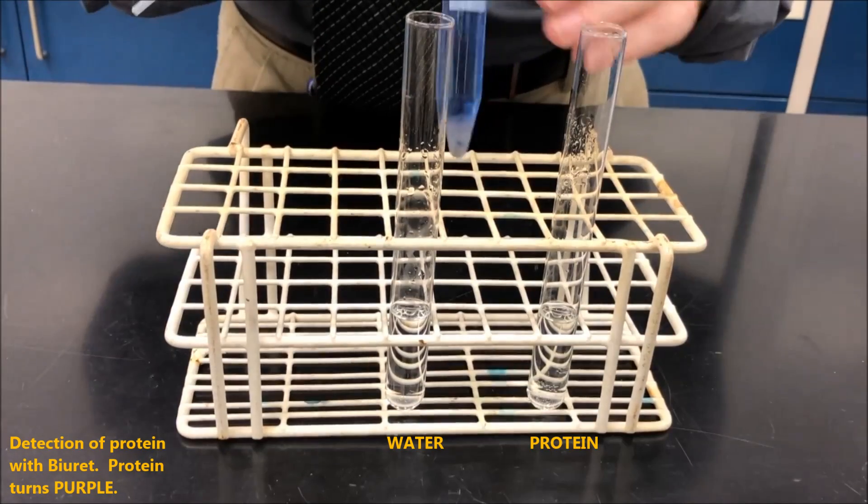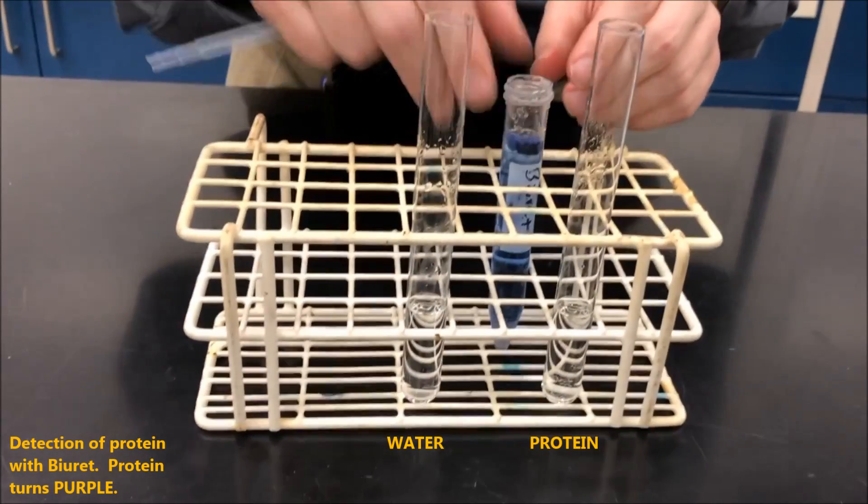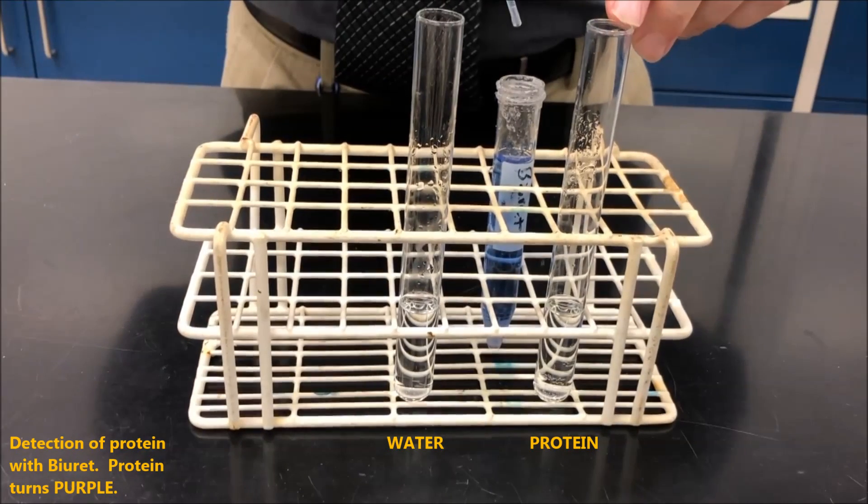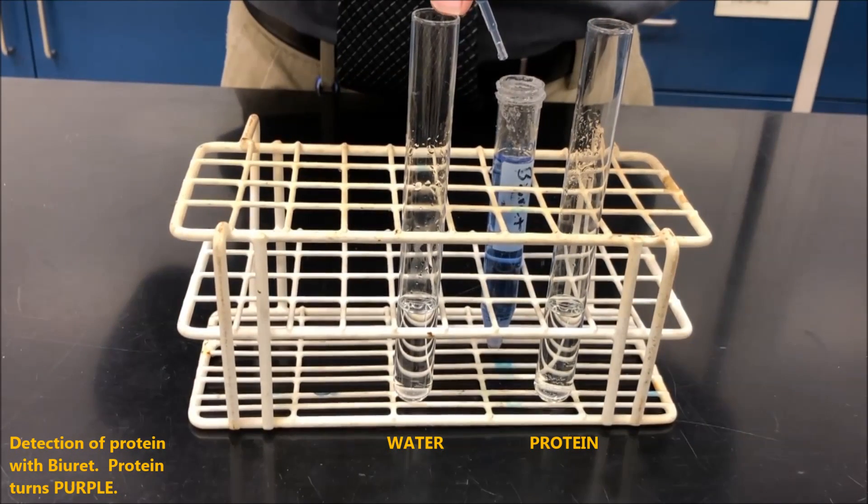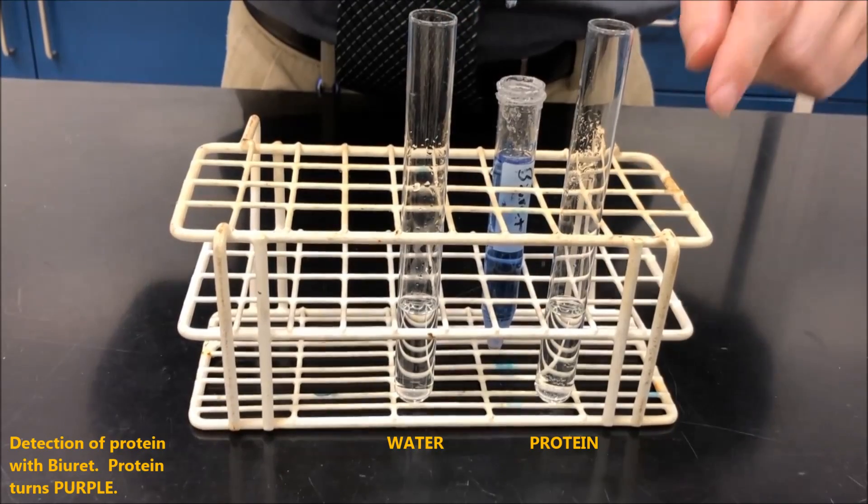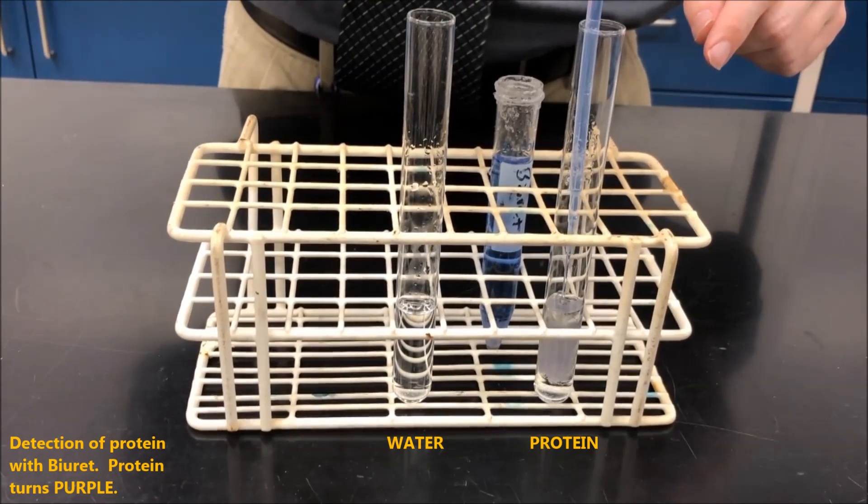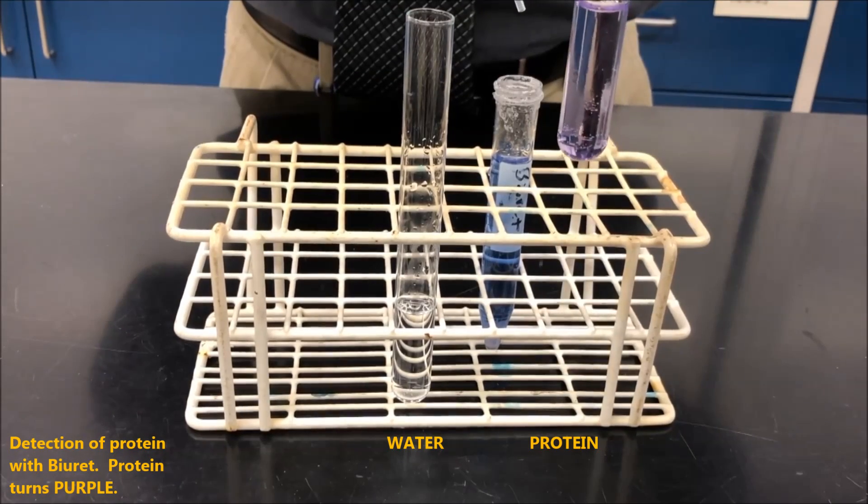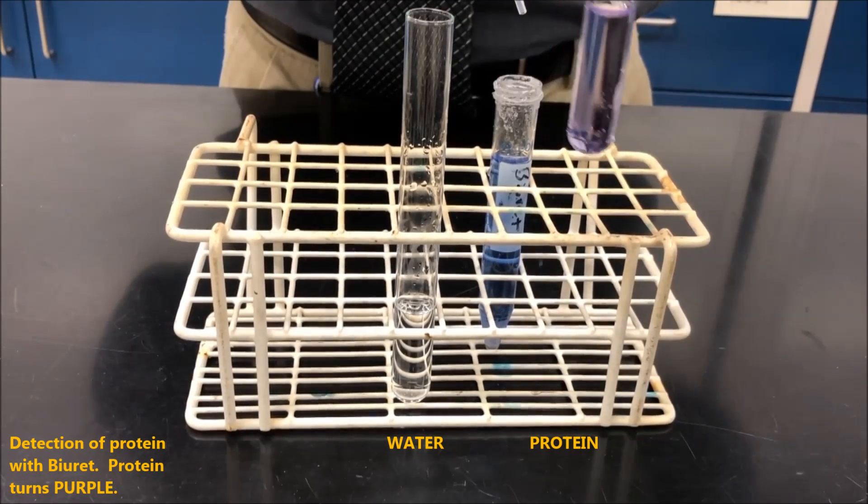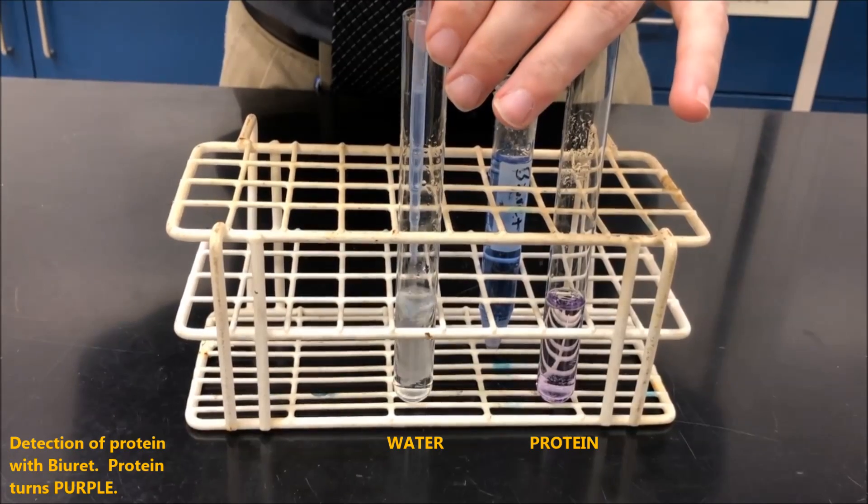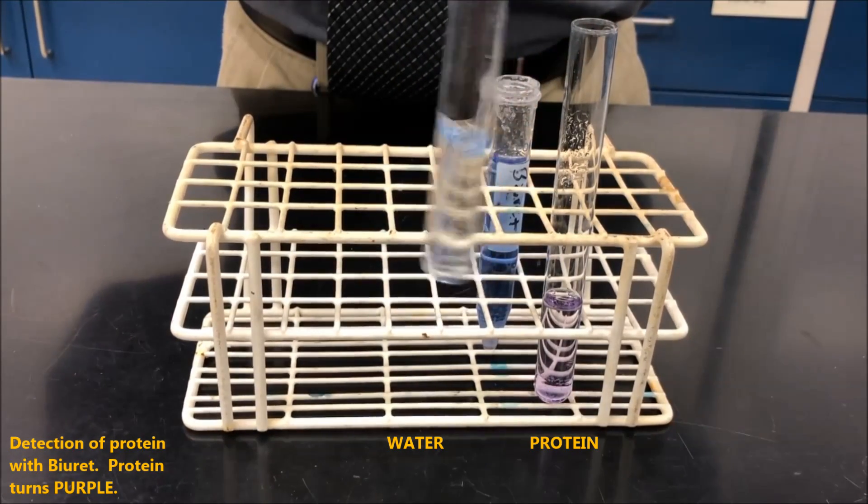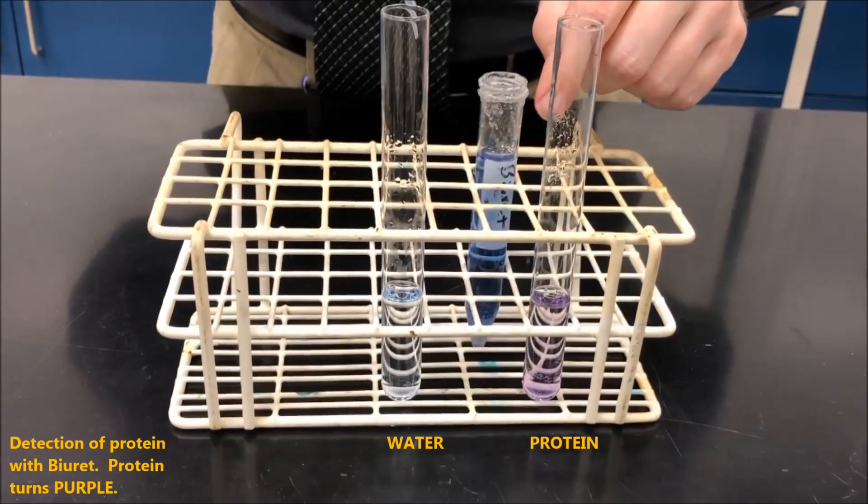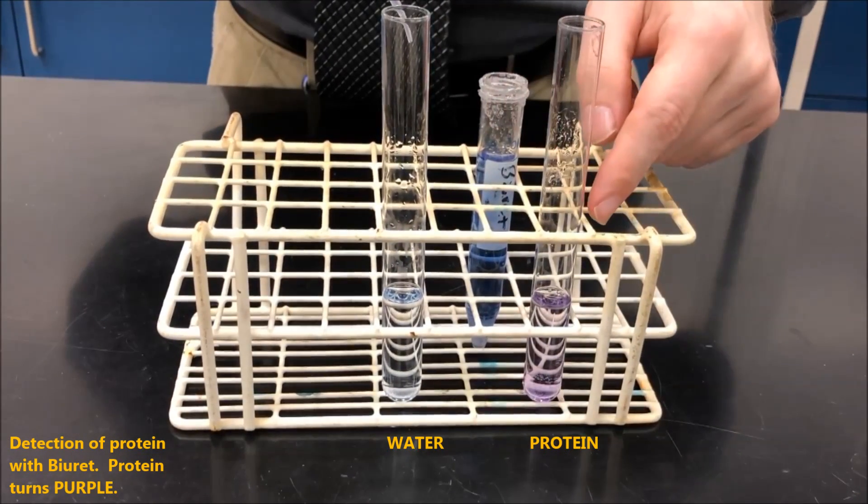So here is my solution of Biuret. I'm going to add a few drops. One of them contains protein, and one of them will serve as our control of just plain water. As you can see, the one that has protein turned purple, while the other one stays blue. So in the presence of protein, Biuret will turn purple.